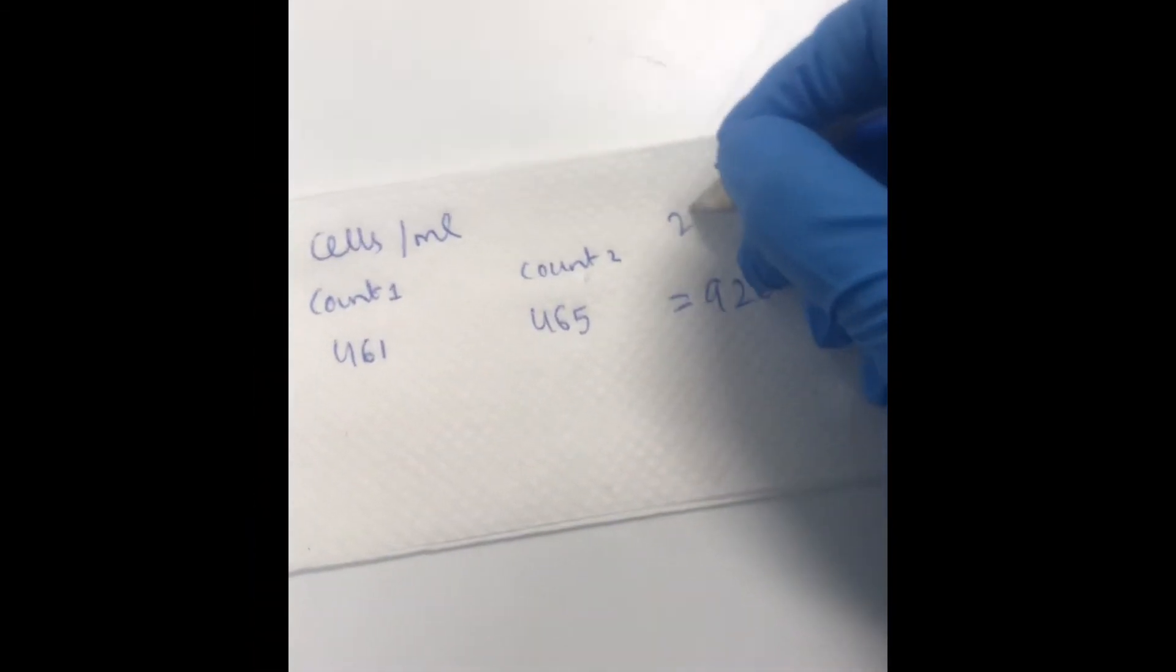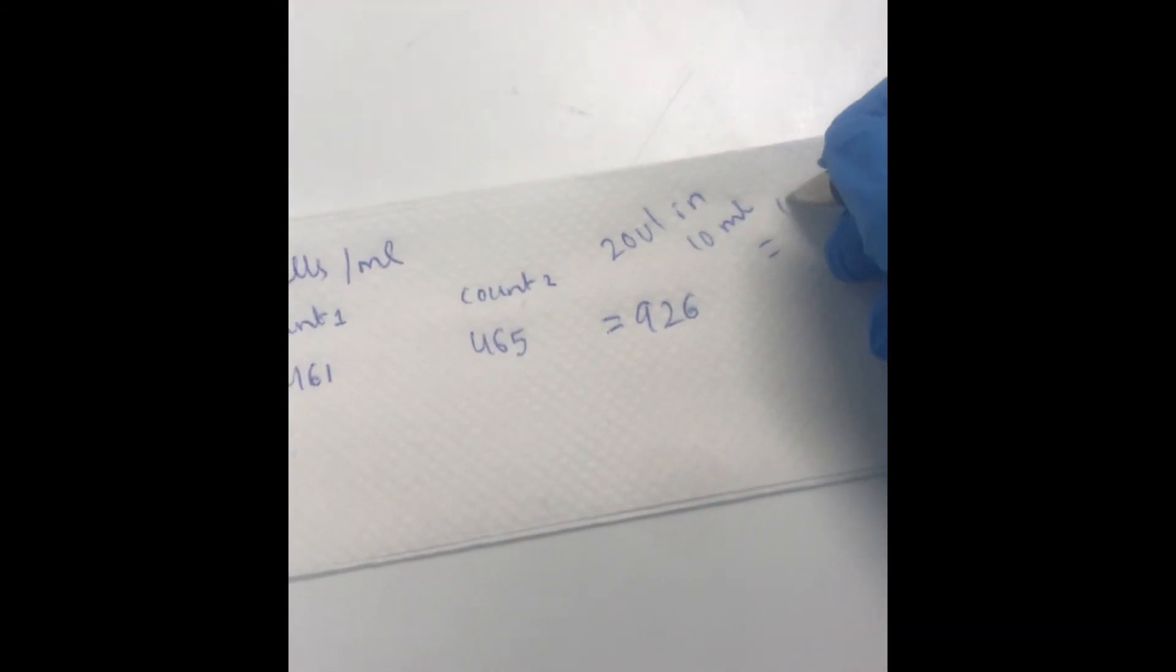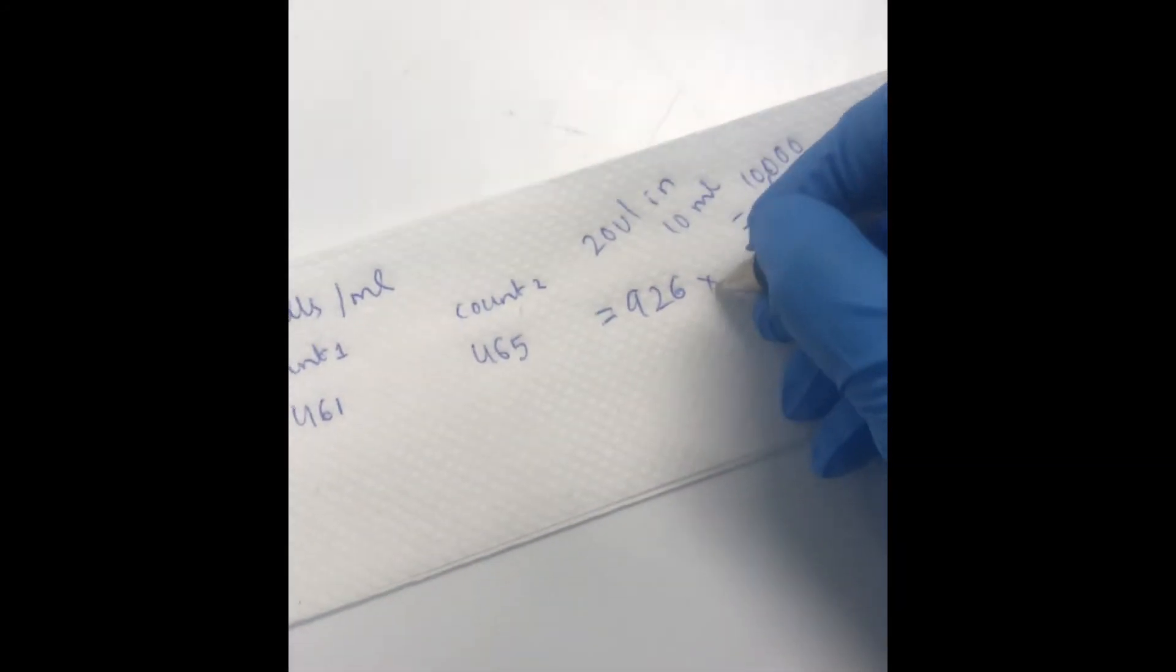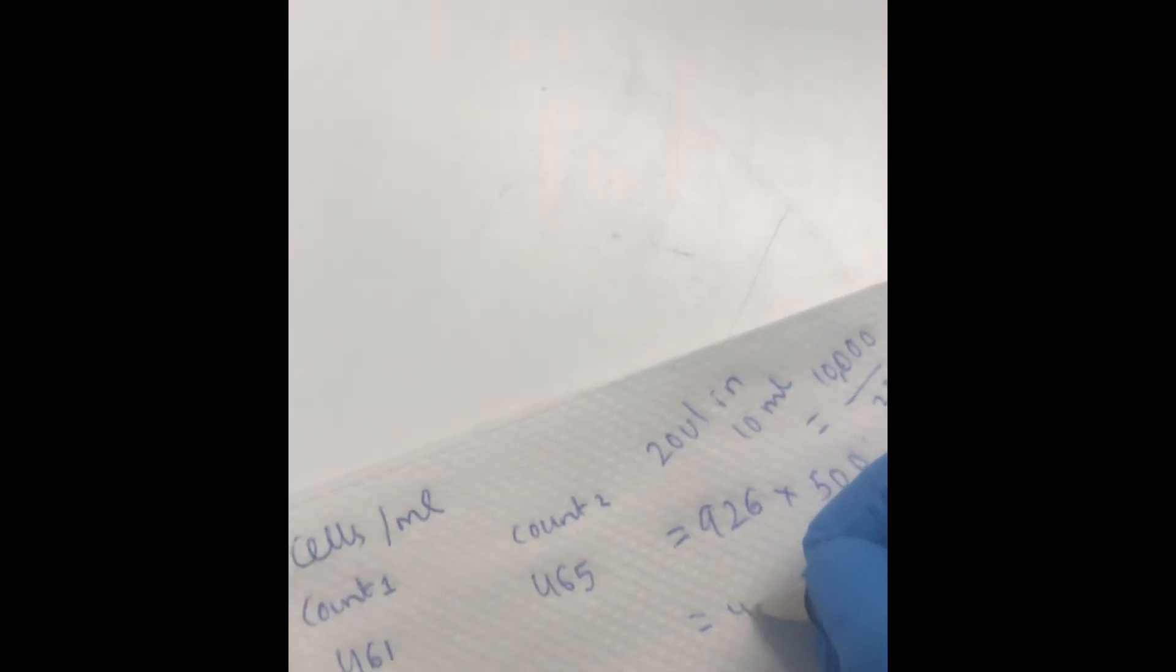Now I'm calculating dilution factor. So 20 microliters and 10 ml of isotonic solution, the dilution factor comes to 500. The 10 ml is 10,000 microliters. You multiply the dilution factor with the number of cells to give the number of cells in one ml of your solution. That's it.